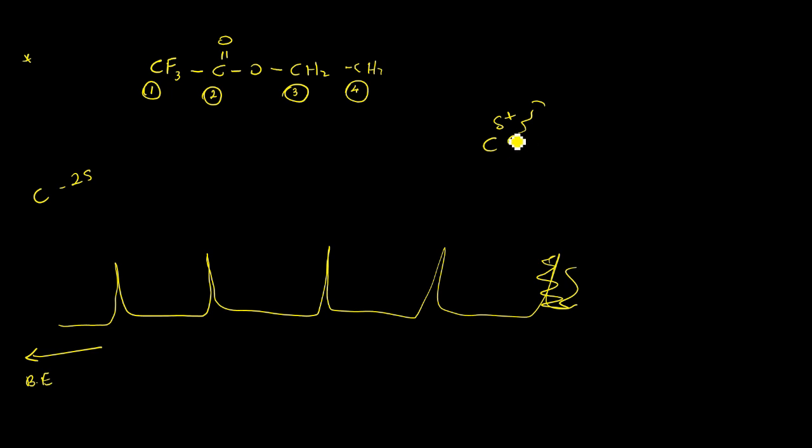So this electron will have that extra binding energy. The electron will feel the binding energy is relatively high. So in this case, the carbon with 3 fluorine atoms must have very high binding energy. Compared to the other carbon atoms, this carbon atom has the most positively charged environment. So this carbon atom will create the highest binding energy for the releasing electrons. So the highest binding energy peak should be for this carbon.